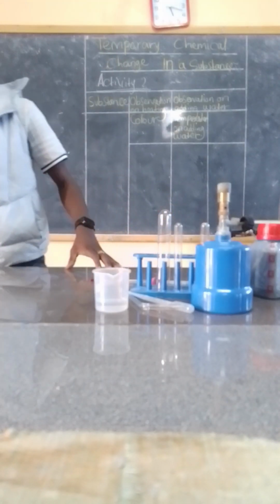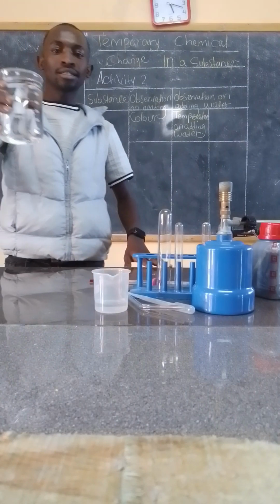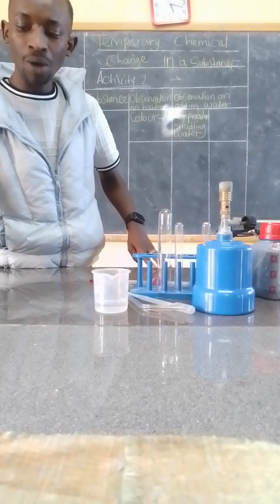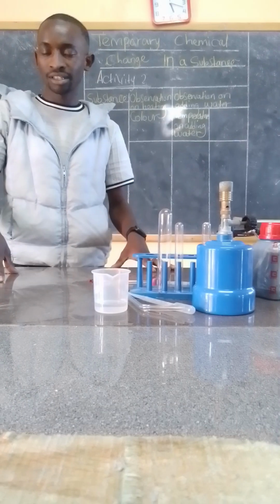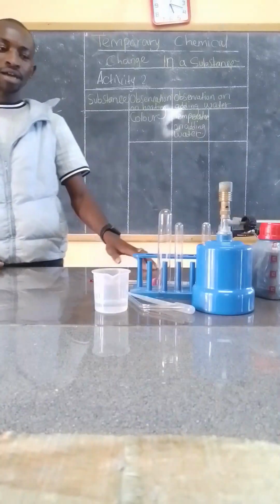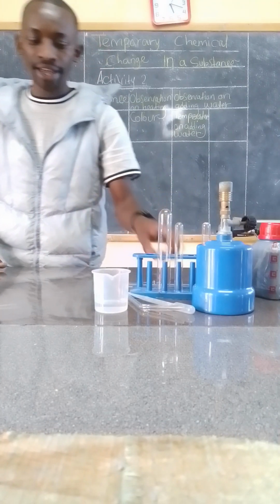You are also required to have with you ice cold water. For this case, this water will work as our refrigerator, our coolant. For those who know why I'm calling it a coolant, it's the one that is going to condense the vapor.